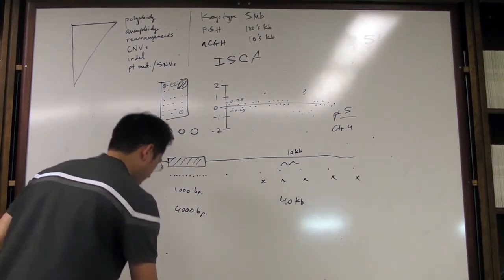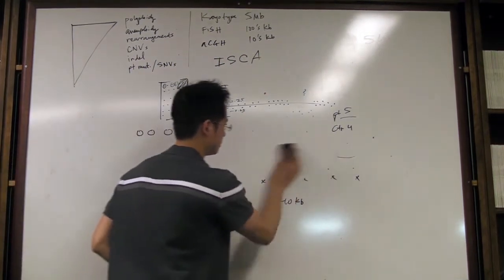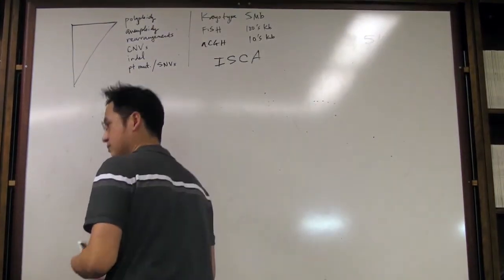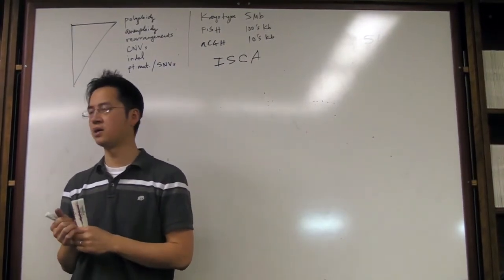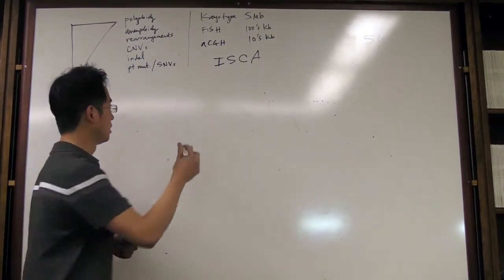But there's one drawback about arrays, though. You know what that is? Mutation. What's that? You said point mutation? Yeah, well, point mutation you cannot get by nature of the assay. You won't be able to get it by array CGH. But there's another important one.